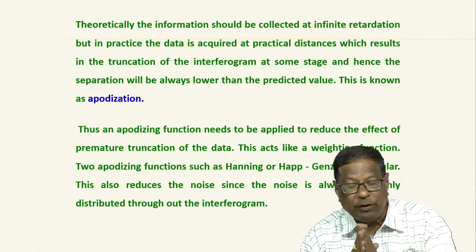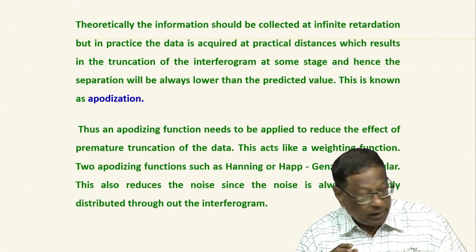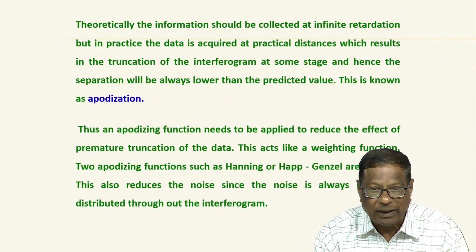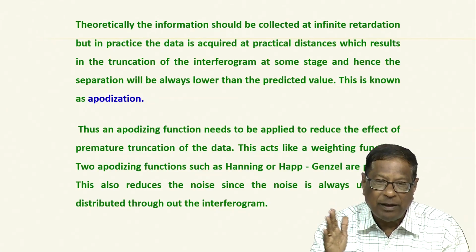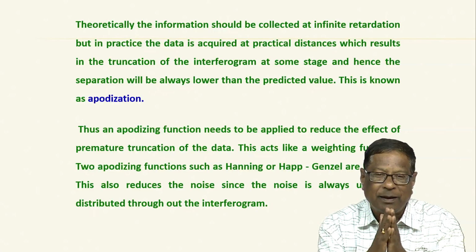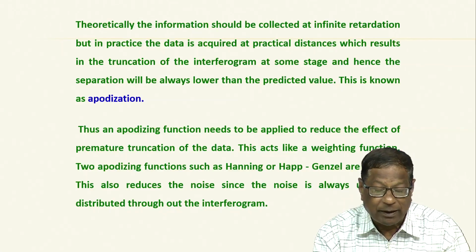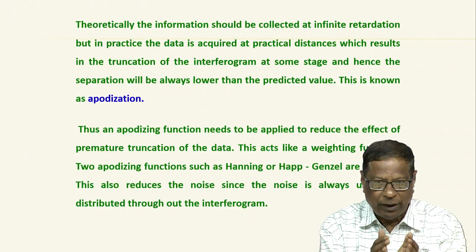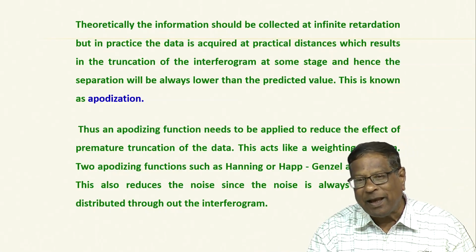So, I want you to understand now that what I have obtained is an interferogram. What I have shown you earlier in my drawing is an interferogram. How that interferogram can be divided into small portions and then converted into a spectrum. The spectrum can be converted if I use Fourier transformation. First I have the interferogram, and when I do this Fourier transformation, I get the IR spectrum.